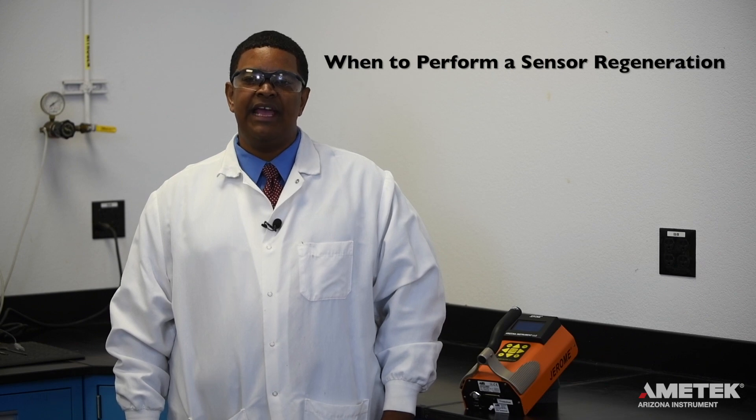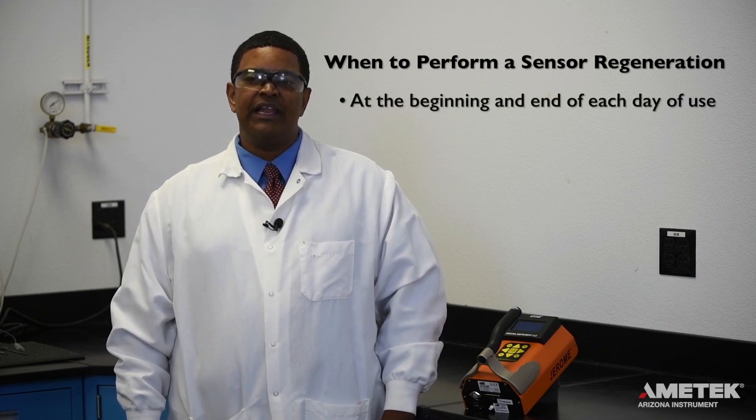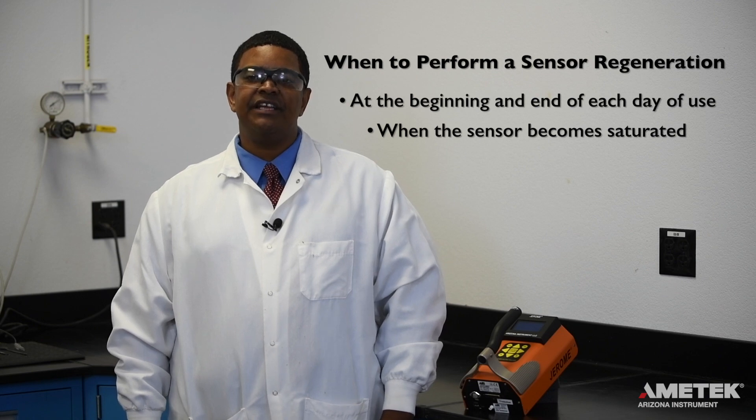Now that you are well acquainted with your Jerome J605, there are just two more steps before you can begin sampling: performing sensor regeneration and the clean air system check. Sensor regeneration should be performed at the beginning and end of every day you are using the instrument, as well as whenever the sensor becomes saturated. Regeneration helps to reset the sensor so that it can continue to provide accurate and precise readings.